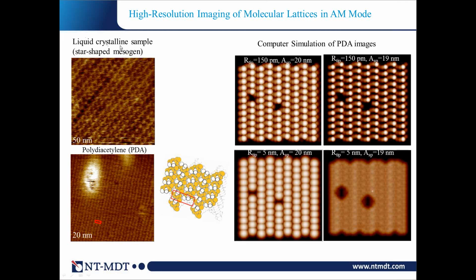But here I took my old data, done in 2004 on the left side, with the Dimension 5000 instrument, which does not exist anymore. I wonder whether at the moment any commercial instrument can repeat the quality of the results obtained with amplitude modulation mode on this machine. The reason was that it had extremely low thermal drift.